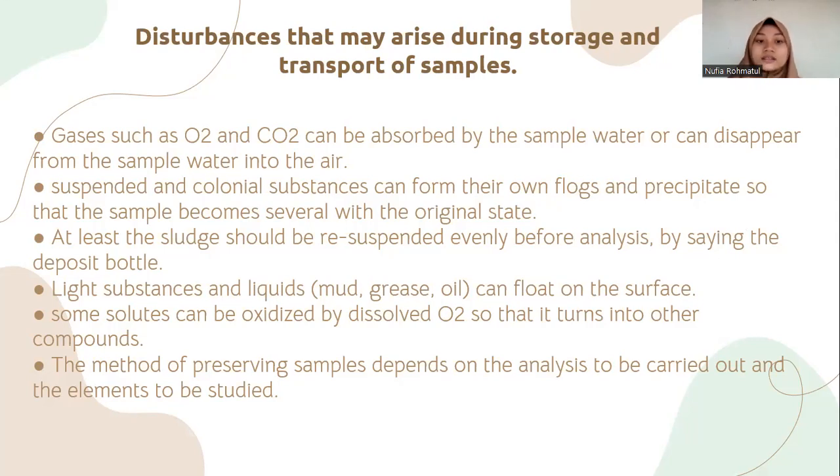Light substances and liquids, mud, grease, and oil can float on the surface. Some solutes can be oxidized by dissolved O2 so that they are changed into another compound. The method of preserving the sample depends on the analysis to be carried out and the element to be studied.